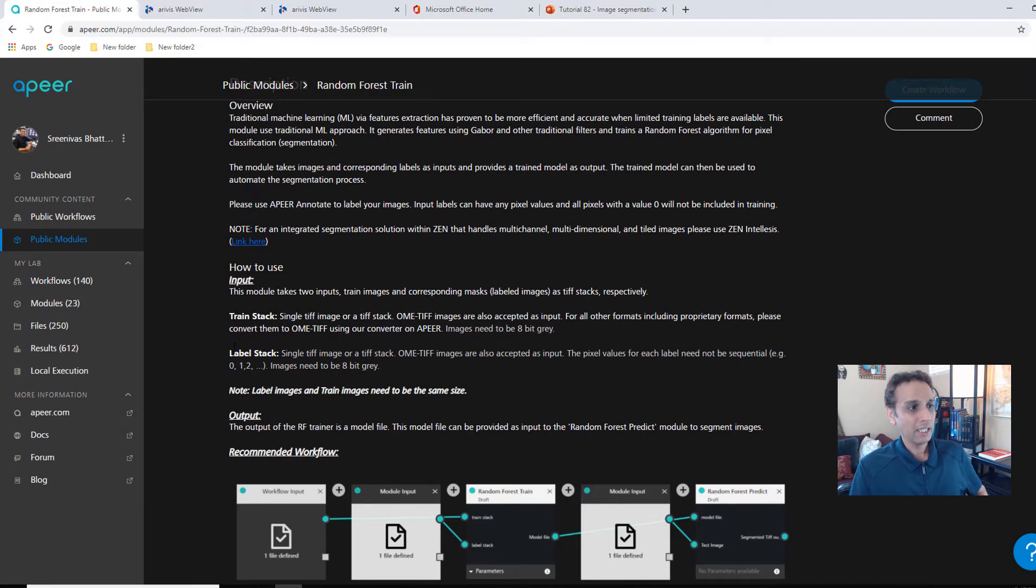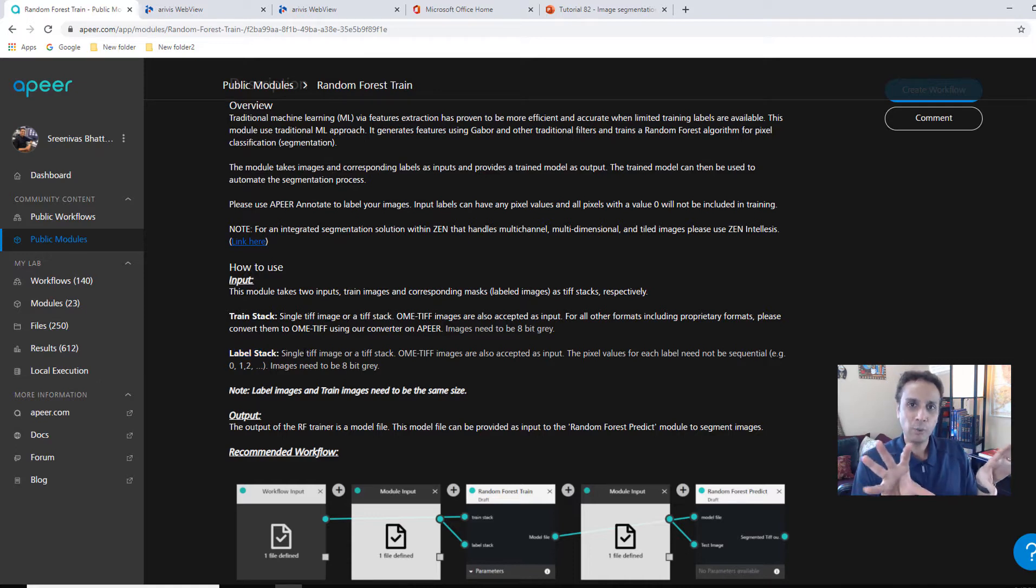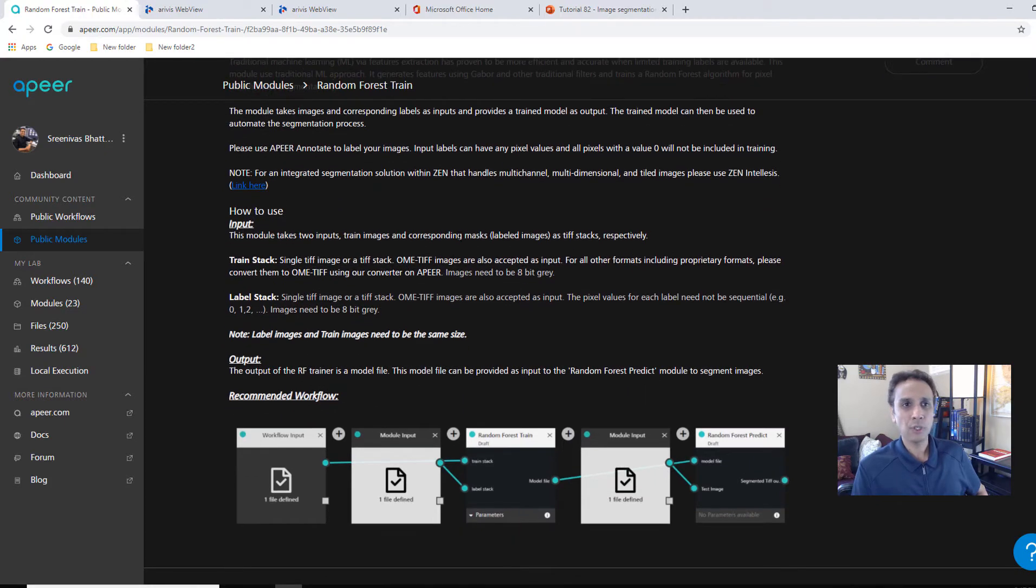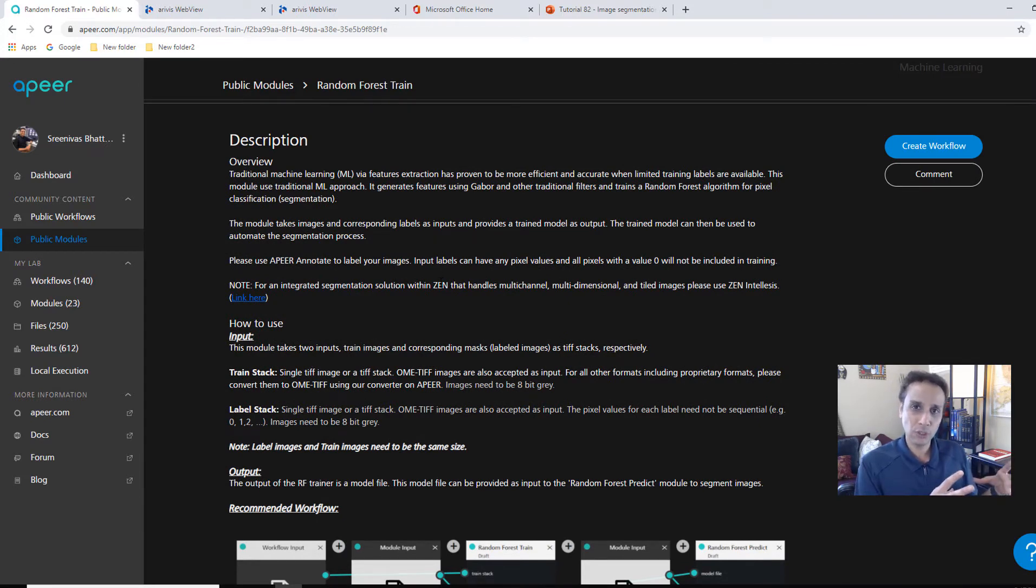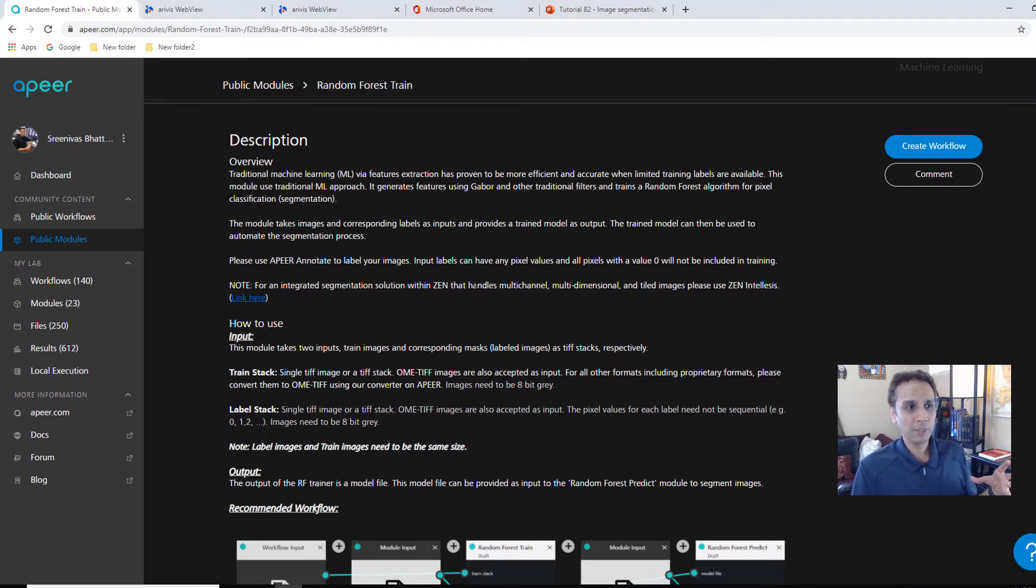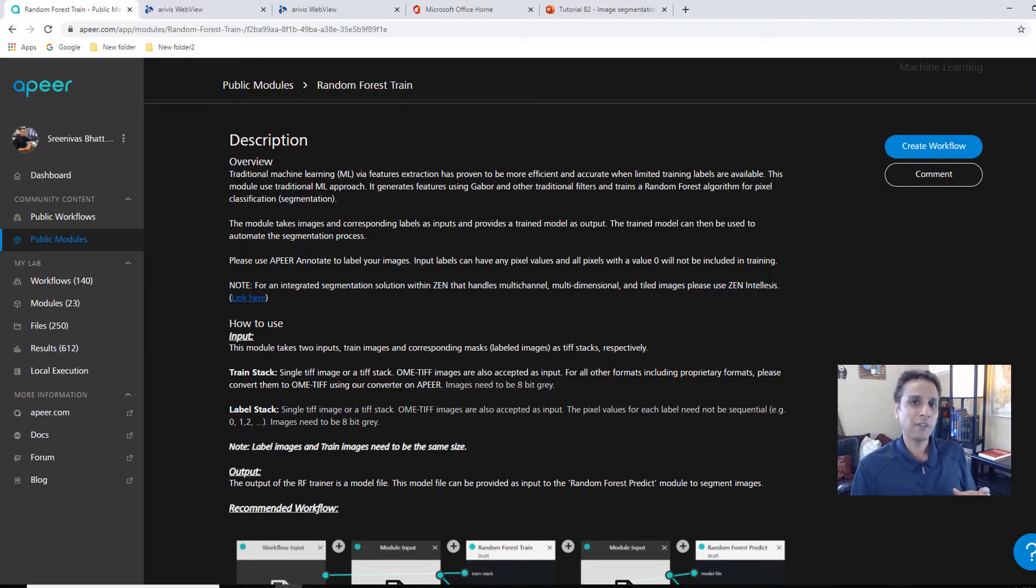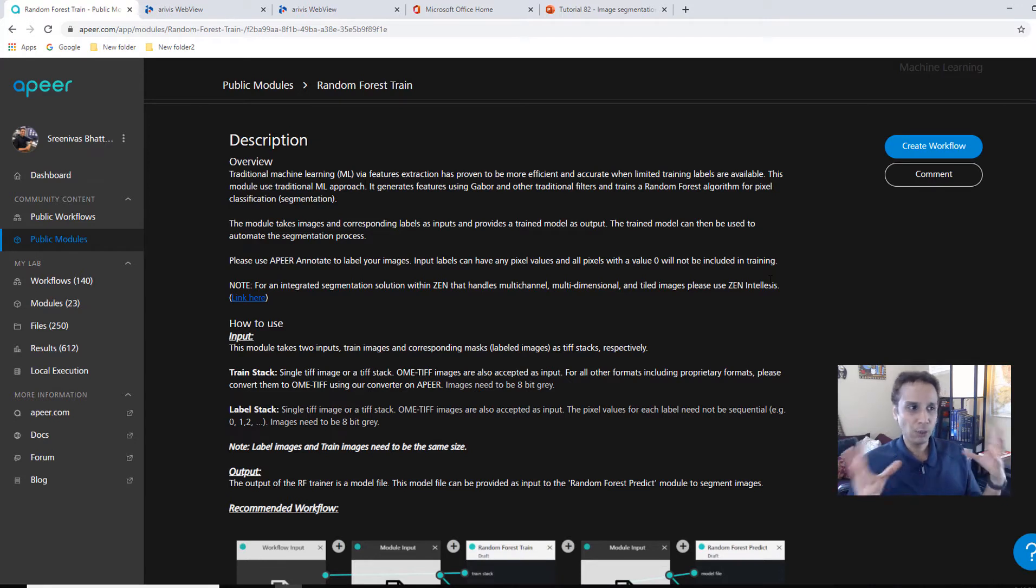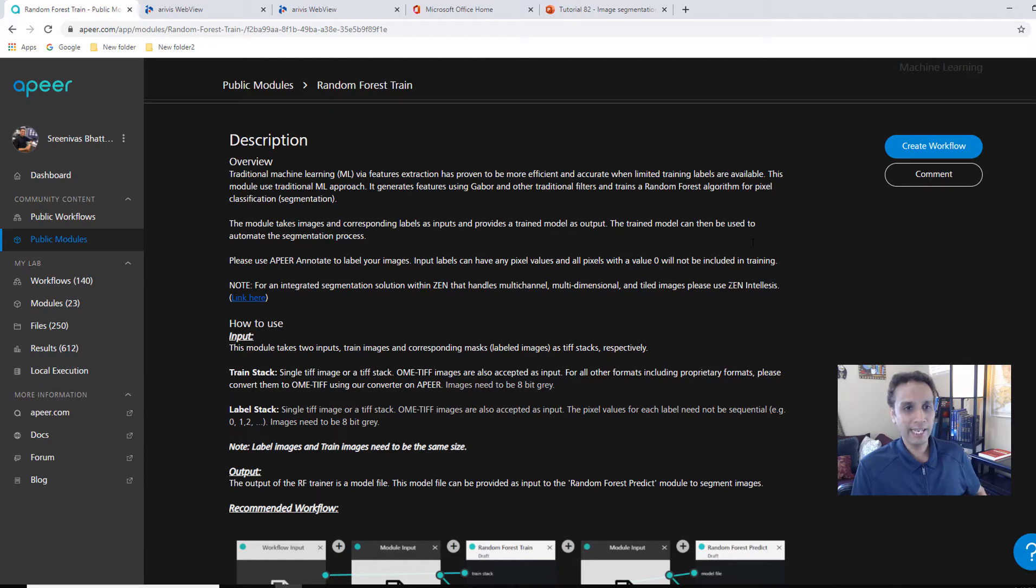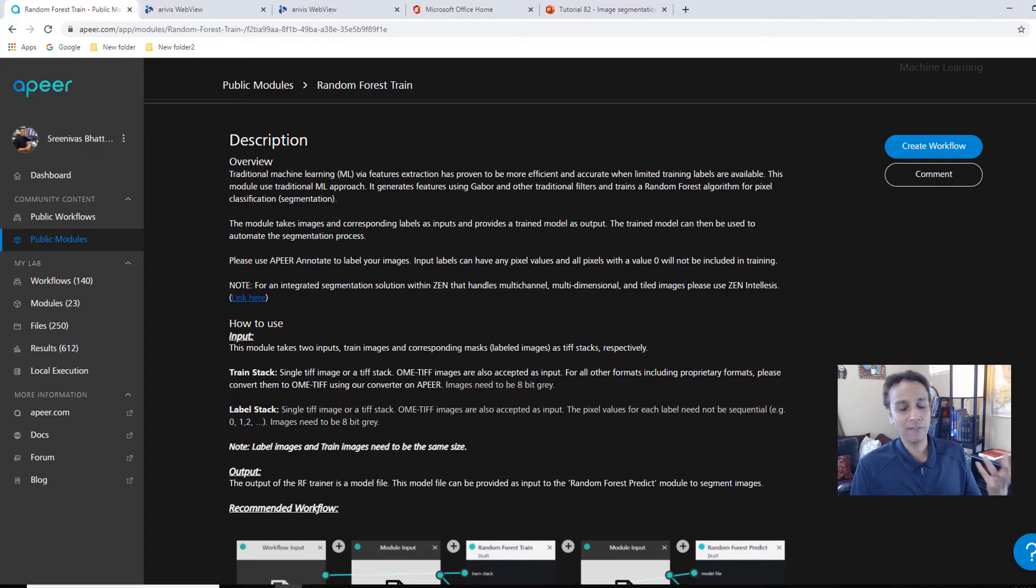The label stack is the corresponding stack with labels. I'll show you how to generate that in a minute. And this actually works great on most of the images. And if you really want a solution that's completely integrated into your Zen, if you're a Zeiss user, you already have Zen, then look up Zen IntelliSys. We give, I believe, 30 day free trial for IntelliSys where you can paint and you can do things. And it's amazing. It works on multi-channel images. It works on tiled images.